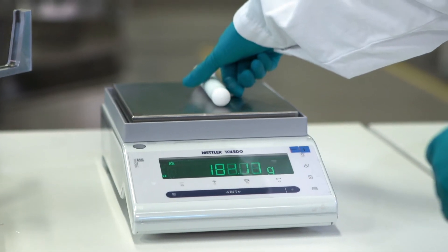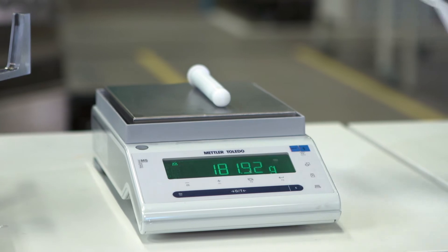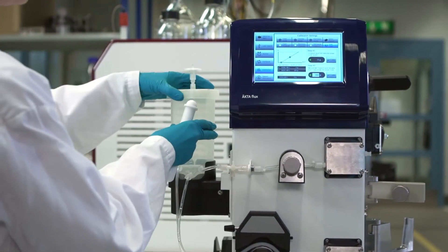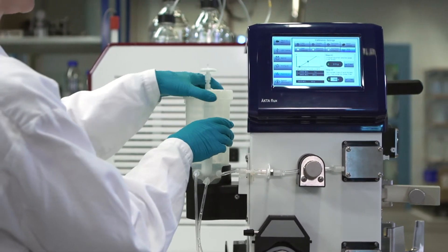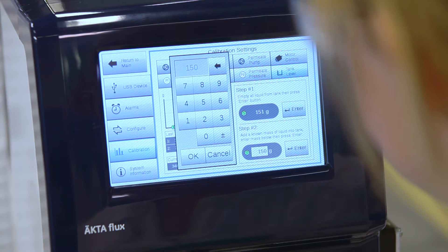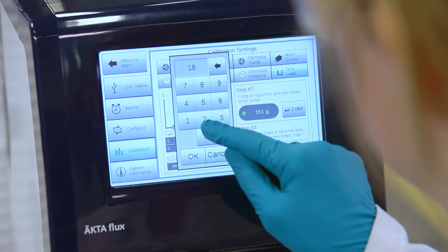Weigh an amount of fluid or small item on a separate scale and note the weight. Pour the fluid or place the item in the reservoir. Enter the known weight on the touchscreen under step 2 and press enter.